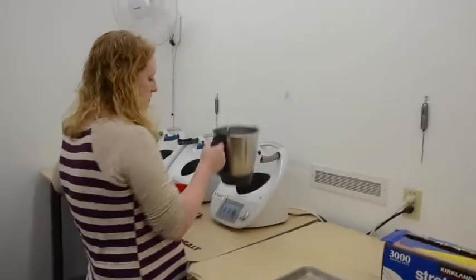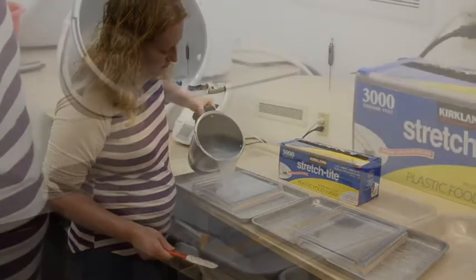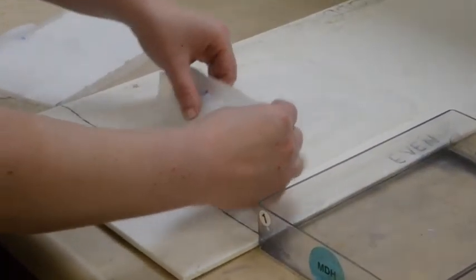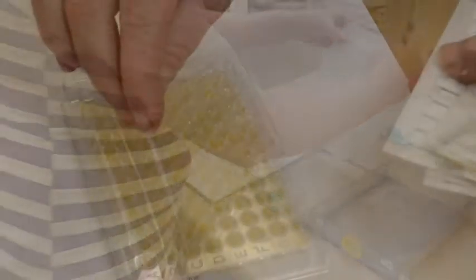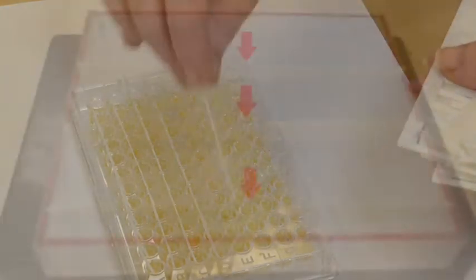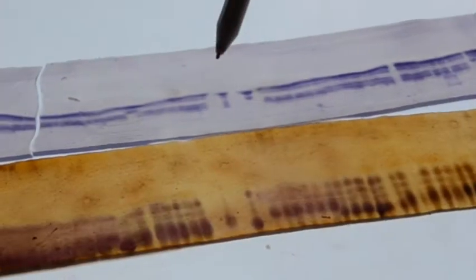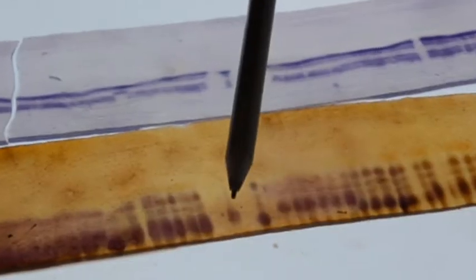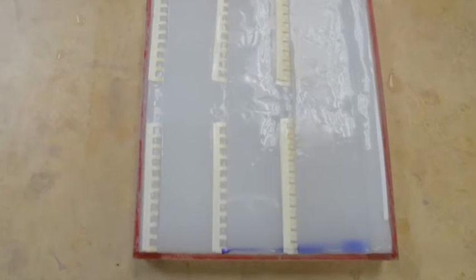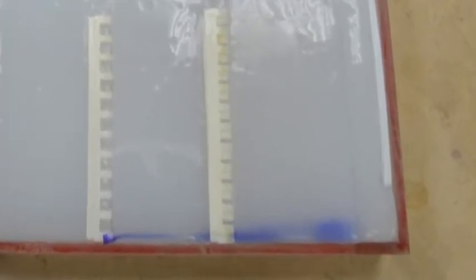Potato starch is also non-toxic and the pore size is conducive to protein migration. With the addition of sucrose, these gels are relatively easy to handle and when we slice them for the different stains, it allows for multiple isozyme stains from a single gel. We use paper wicks to transfer the individual seedling's protein onto the gel. We also have check samples with known banding patterns placed in the middle of each tier for reference. Finally, a tracker dye is added to the gel to gauge the movement of the proteins while it is running on the electrophoresis machine.